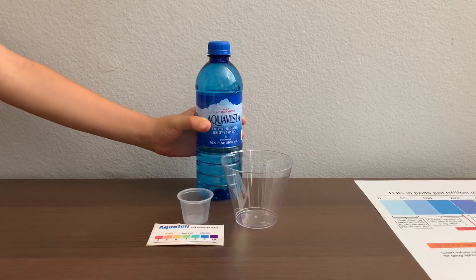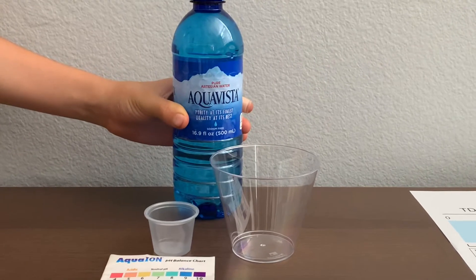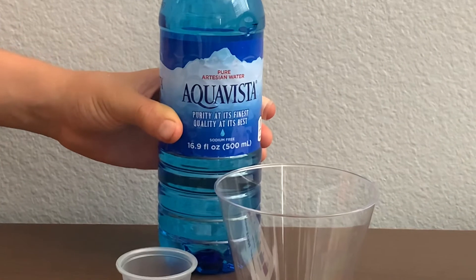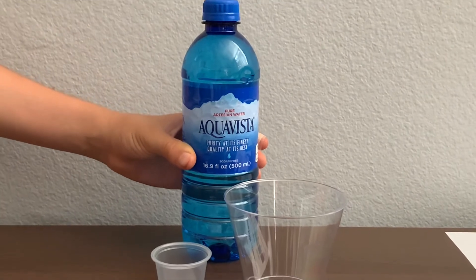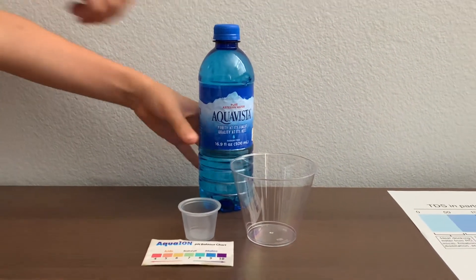This is Aquavista artesian water drawn deep from the medicine formation of the Bighorn Mountains in Wyoming. A pack of 24 costs $5.99. It's sold at Harman's Grocery Market in Utah. Let's test the pH and TDS levels.